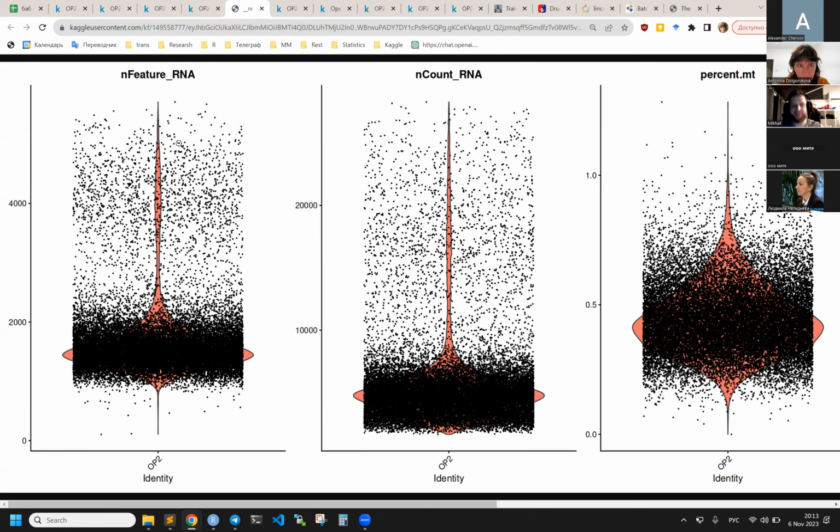Okay, thank you very much. I have a really brief understanding of the data set right now. Okay, it's much clearer now. So this is the typical step in the tutorials, that we can count number of non-zero genes, yes? And another, we can count just the total sum. They should be correlated, but there is some difference.